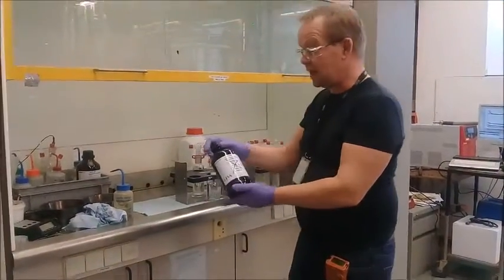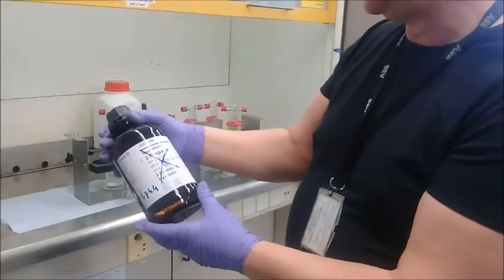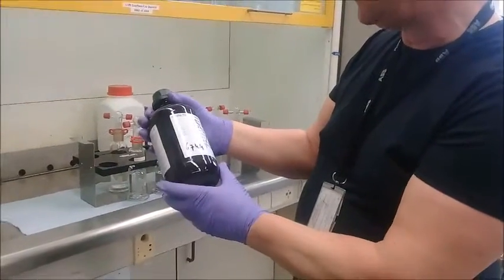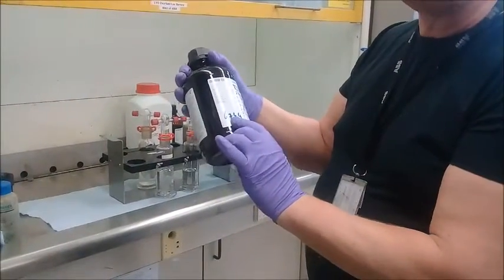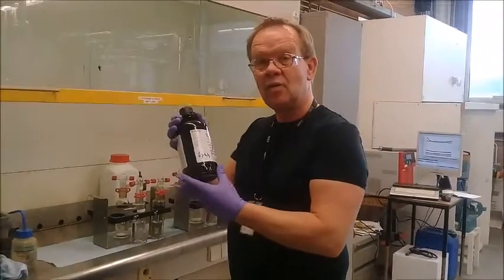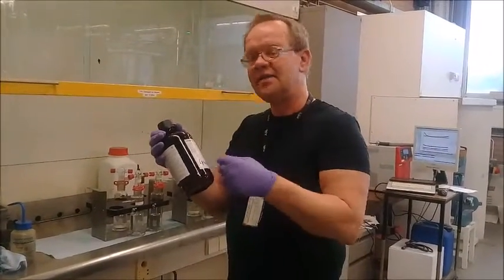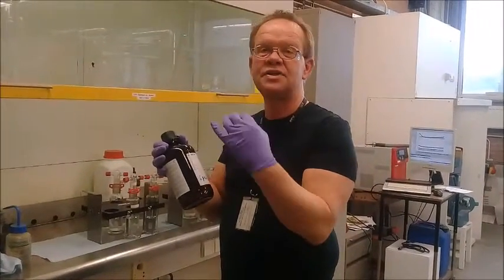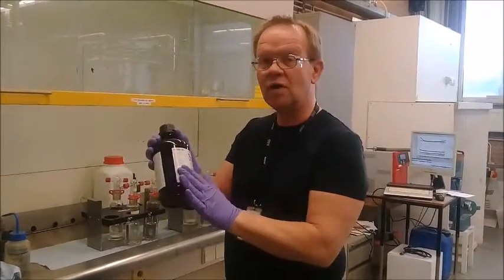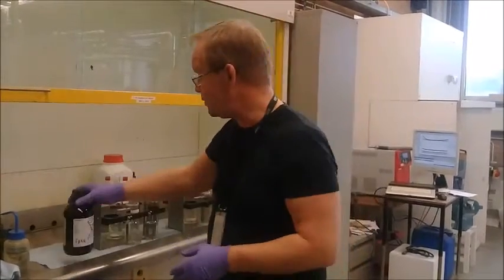The bottles we use are just the bottles that also contain the isopropanol, the real clean isopropanol for gas chromatography, and we weigh the bottle beforehand. That is because we want to know how much liquid we have from the samples in order to calculate the amount of hydrocarbons and sulfur and nitrogen compounds back to the original volume. So we also need the weight of the bottle and the weight of the bottle filled with liquid.